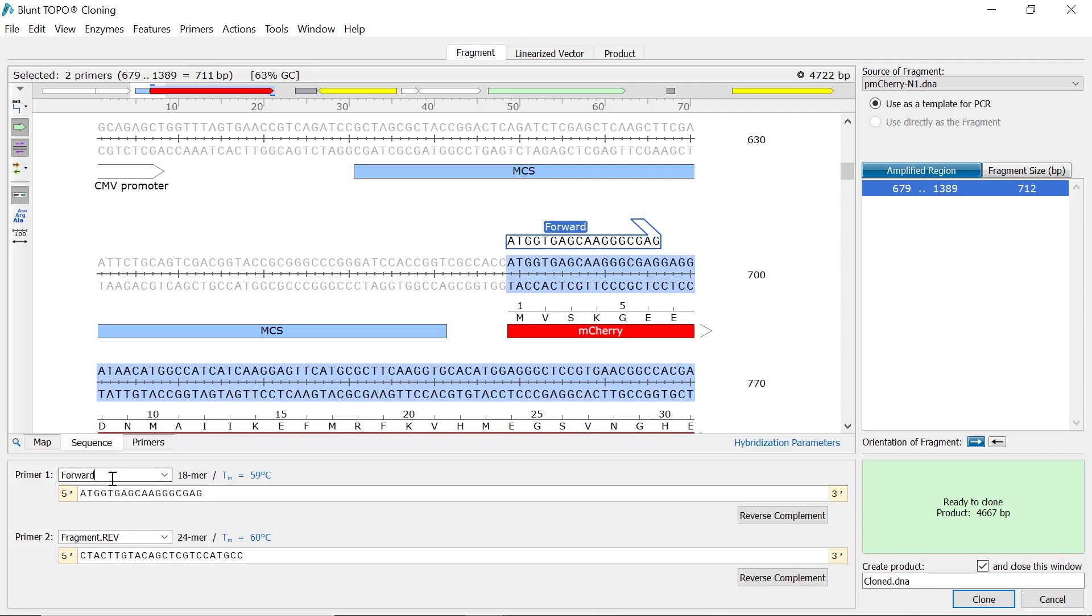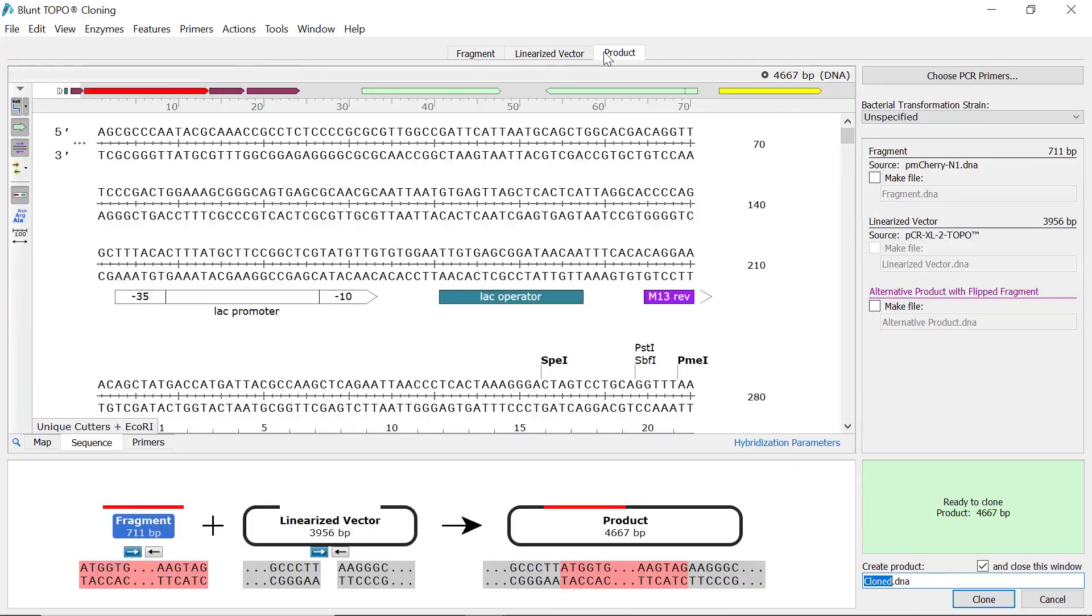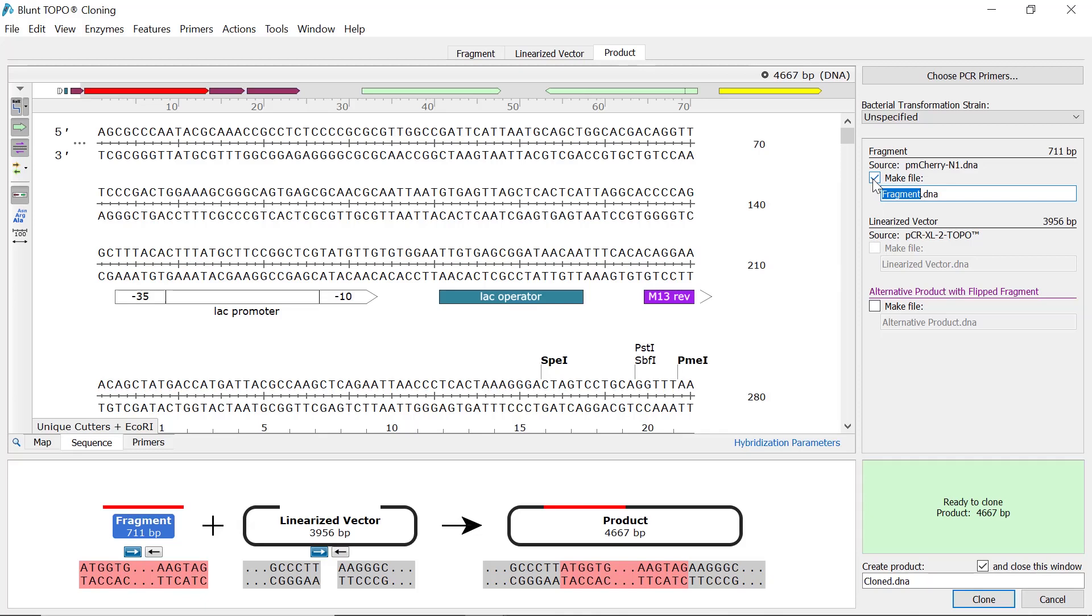Once you are happy with the simulation, switch back to the product tab. You can select to save the intermediate fragment sequence following PCR as a separate file in the panel to the right. And when performing either TA or blunt topo cloning, there is also the option to save a file with the components flipped.